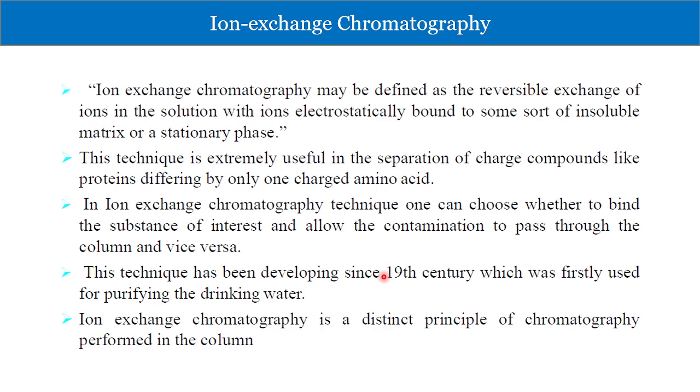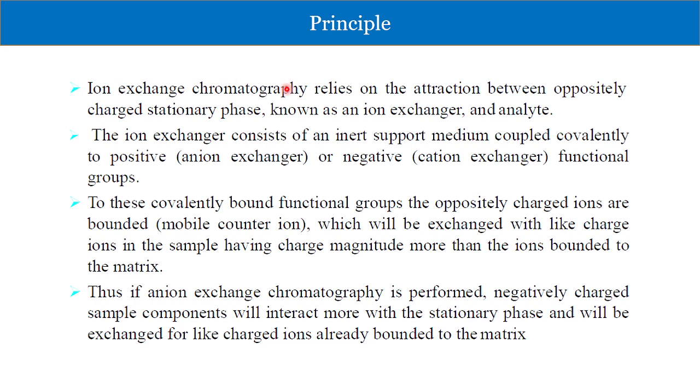And this technique is widely used for the purification of drinking water, and it is a distinct principle of chromatography performed in a column. So these are not very important points, but what you need to keep in mind is that you want to separate out proteins that have a difference in a particular charge. Only then you can use this particular sort of chromatography for the separation of your proteins.